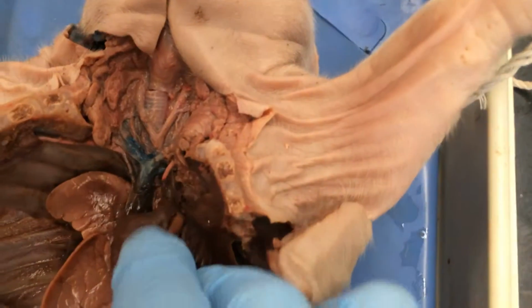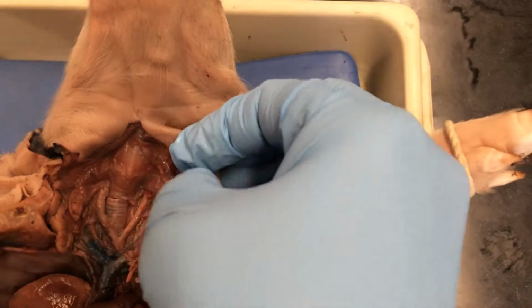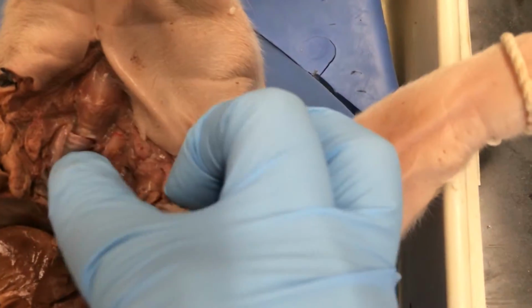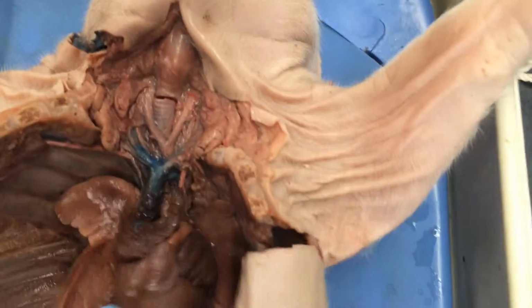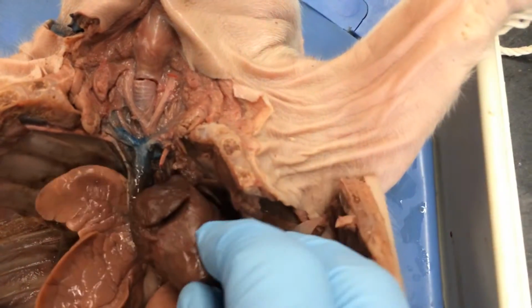Now, if we go up here, coming from the mouth down, this here is the larynx or the voice box, and air comes in through the mouth, goes into the trachea, and I've opened it. It's a hollow tube that contains air. Air comes in through the trachea, down into the right or the left lung.